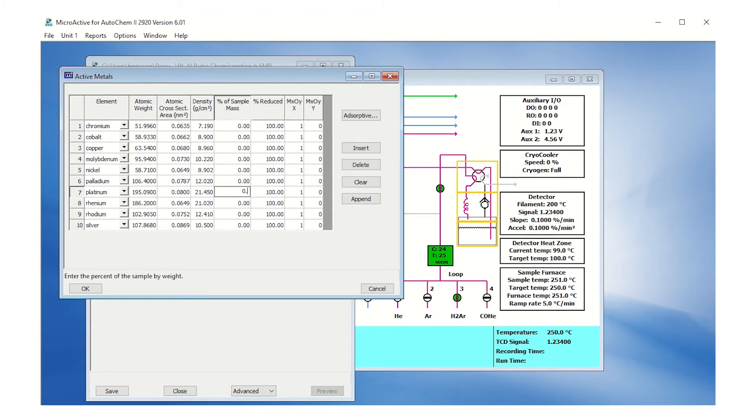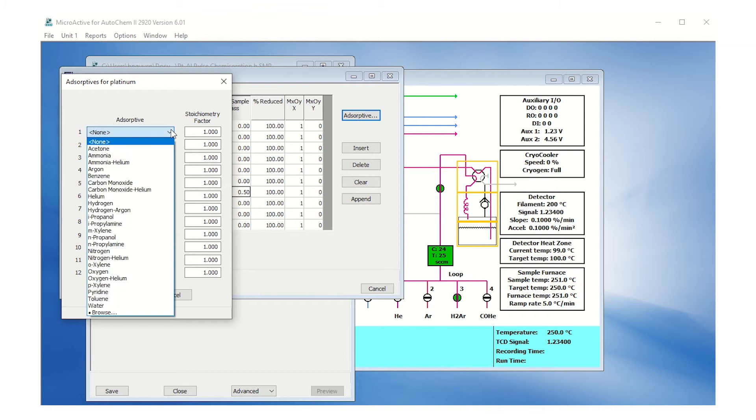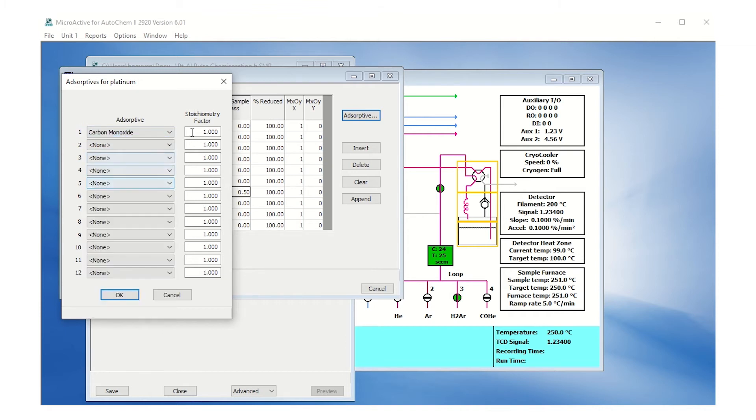For this example, we used 0.5%. While the platinum row is still selected, click the absorptive tab. Use the drop-down menu to change from None to Carbon Monoxide. Set the stoichiometry factor to 1.